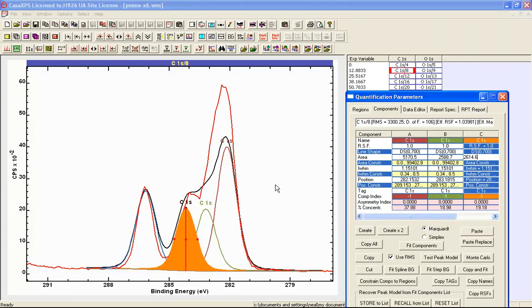So now I have a choice. I can try adjusting these peaks to try and make them fit the data better, or simply press the Fit button. Now when optimizing components to the data, the component parameters will be selected on the basis of the initial conditions of this peak model and the sequence of steps that are taken to move these initial conditions to the final solution.